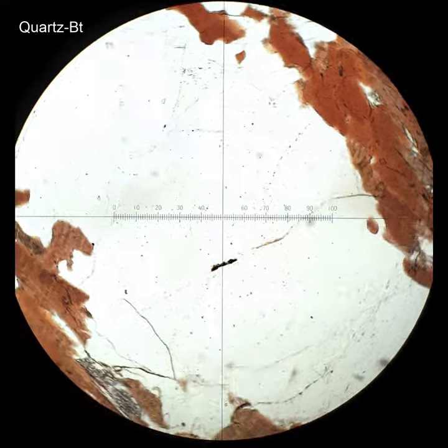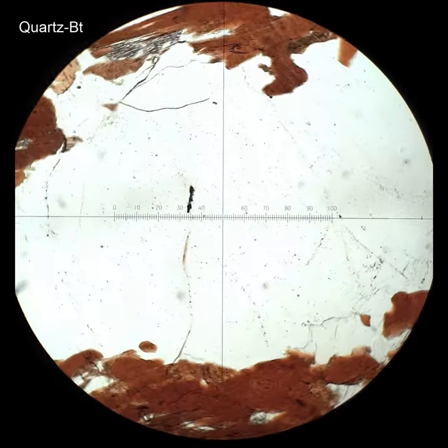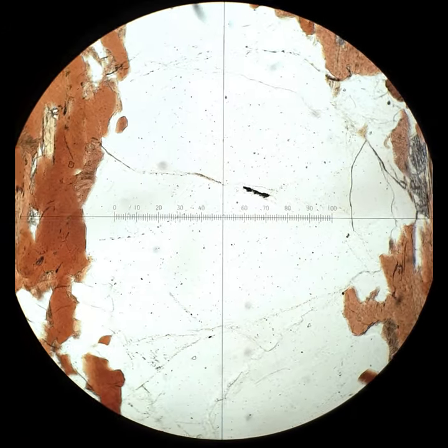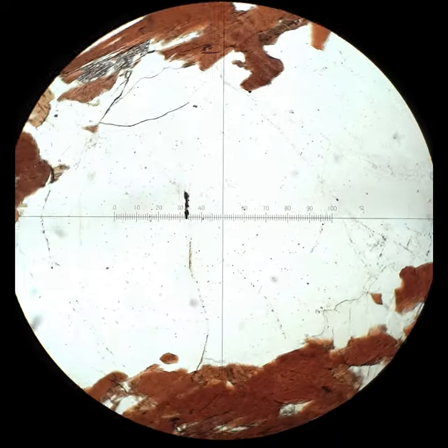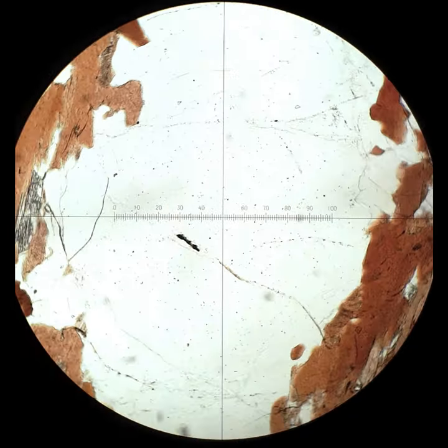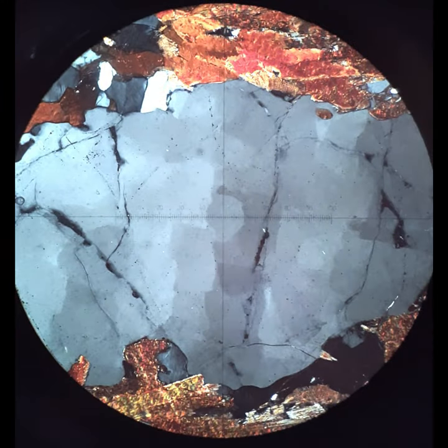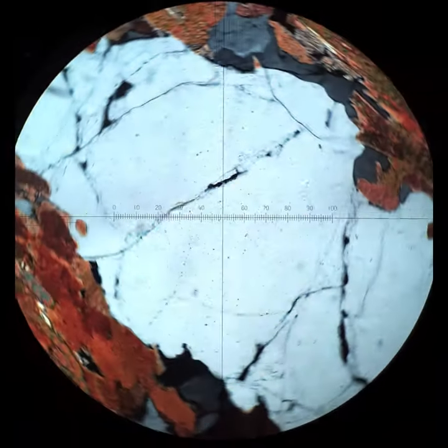More coarse-grained quartz, and what you'll see here as the polars are crossed is that this one has started to break up more completely into sub-grains. The dislocations begin to pile up and they migrate to specific locations and then start to form new grain boundaries. And so that's why it has this sort of mottled look to it.